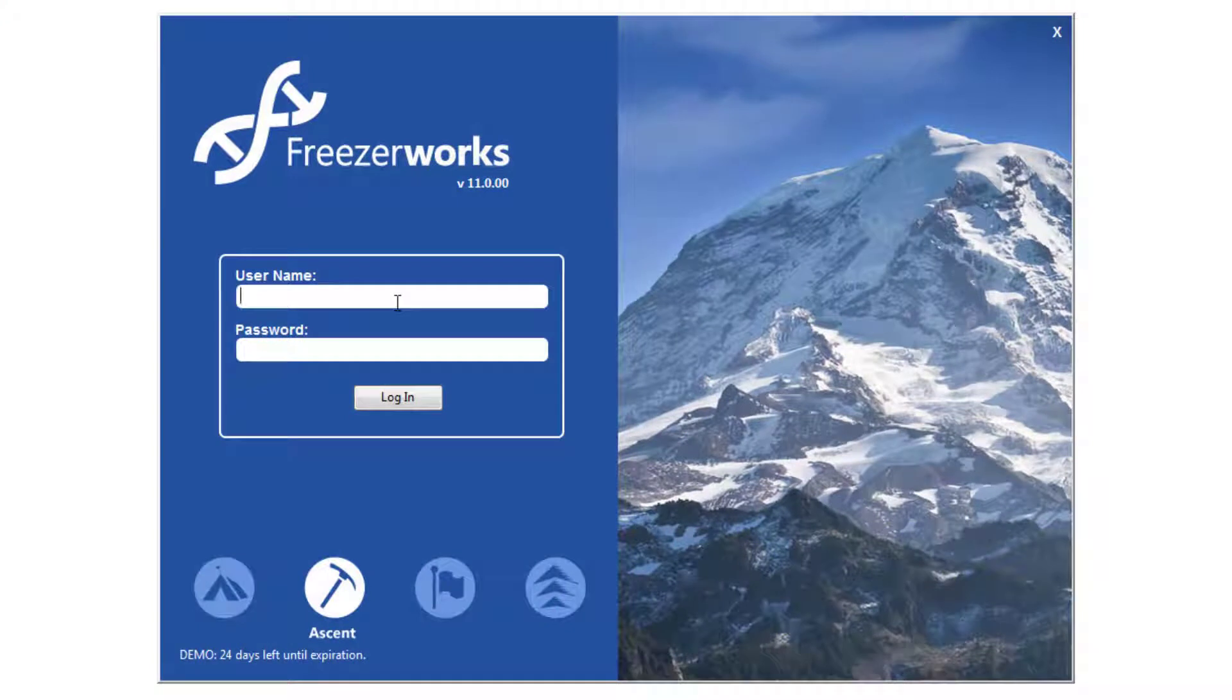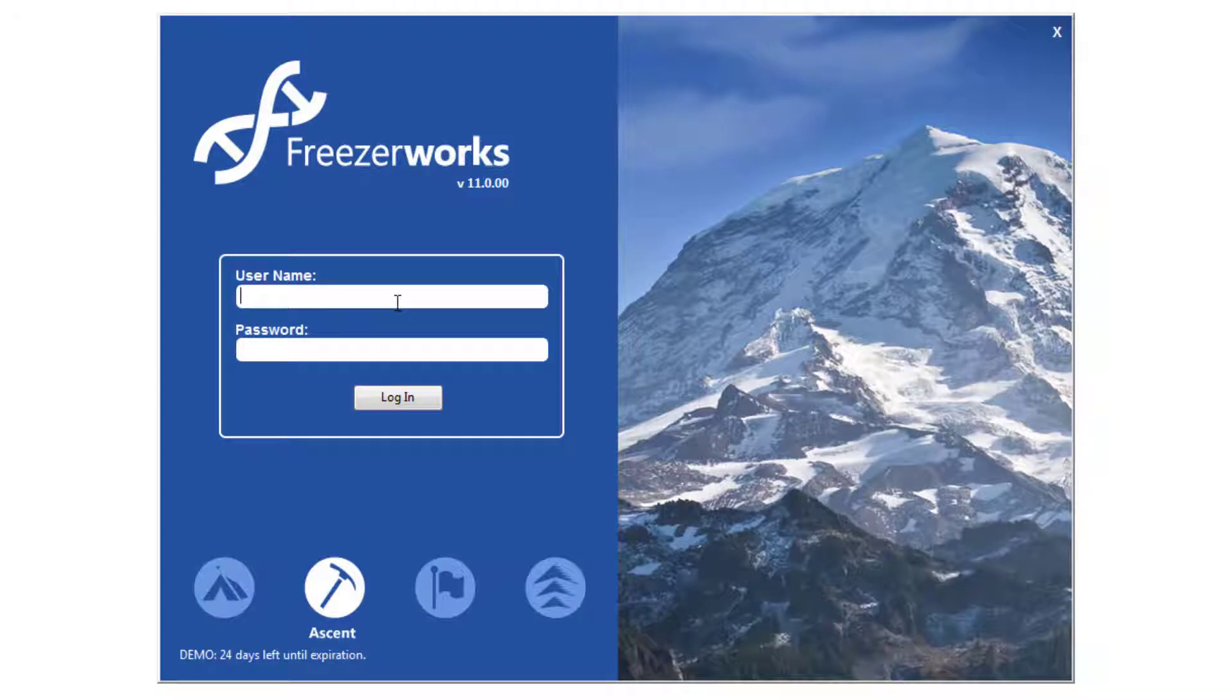Hey guys, welcome to the FreezaWorks 2019 learning series, your visual guide to our sample management software.